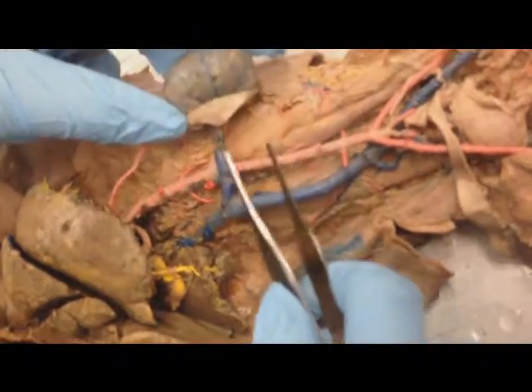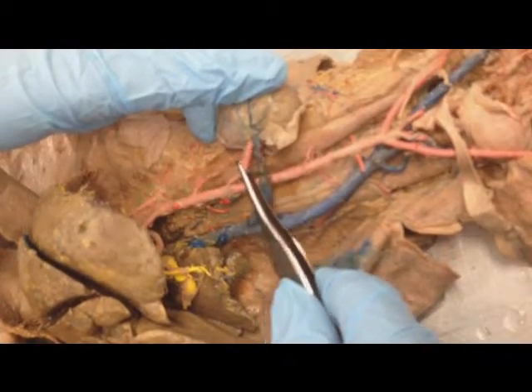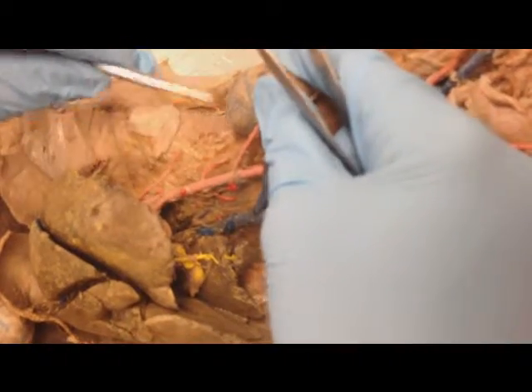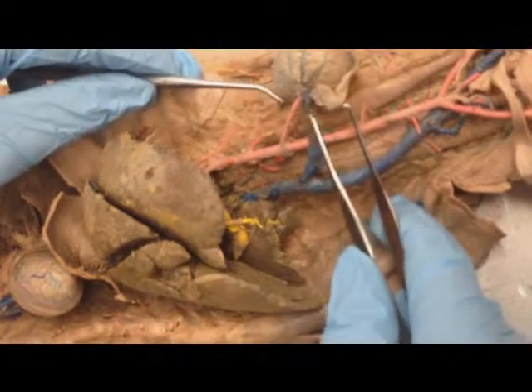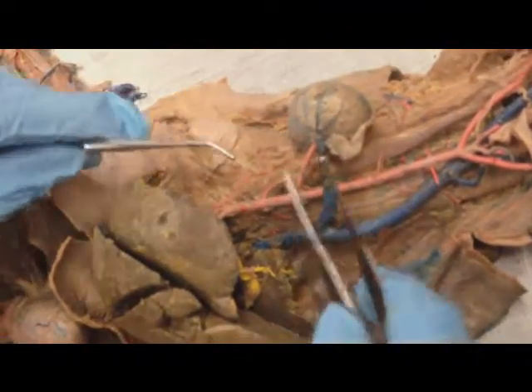Further up, we have your kidneys. So these are going to be the renal arteries. The kidneys sometimes will have a gland on top of them in some of the cats. There's also an artery that attaches to it, and it's called the adrenal artery or the suprarenal artery.